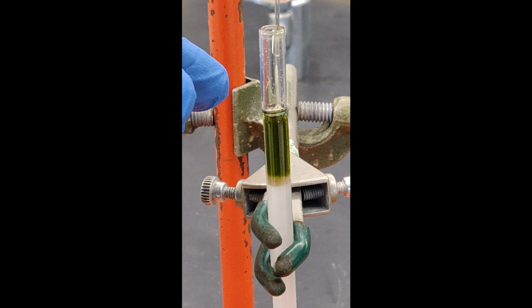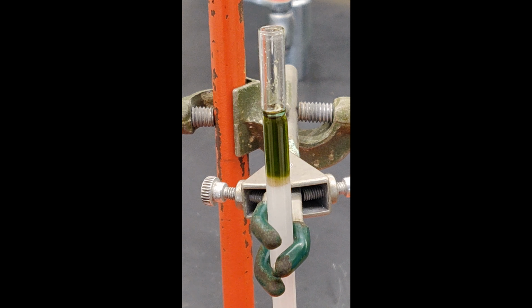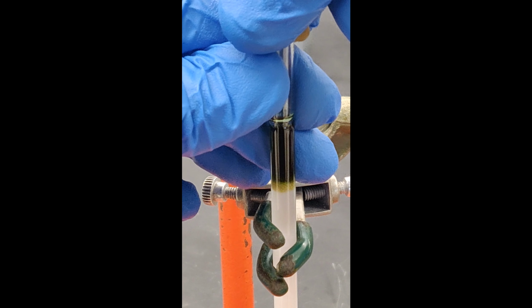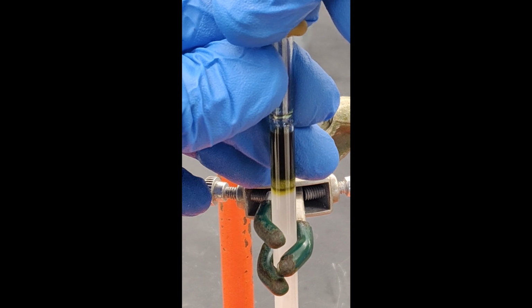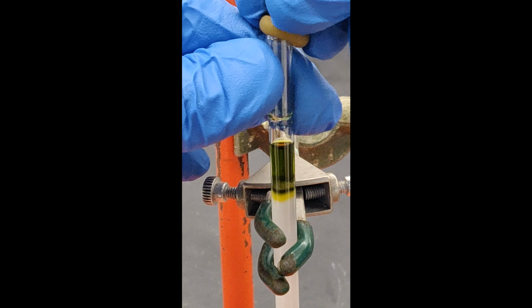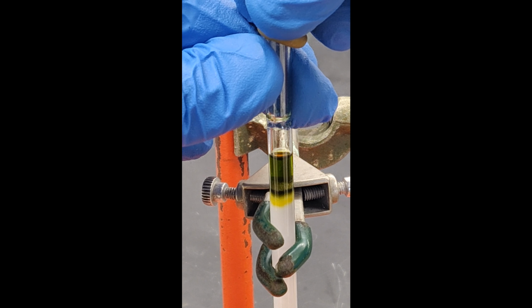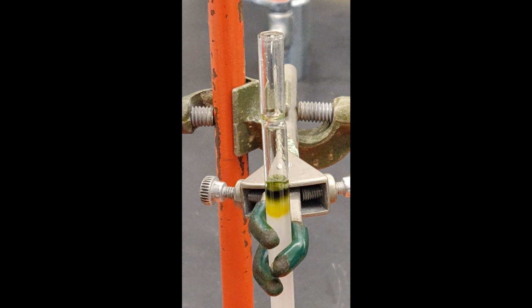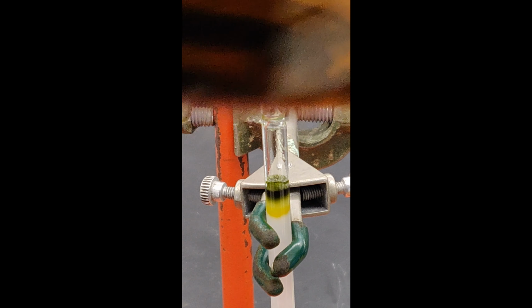Let the extract go just below the level of the sand. You can carefully force it down using air pressure from a rubber bulb. Remember to release the pressure just as the liquid approaches the sand. At this point, you don't want any portion of the column to become dry.